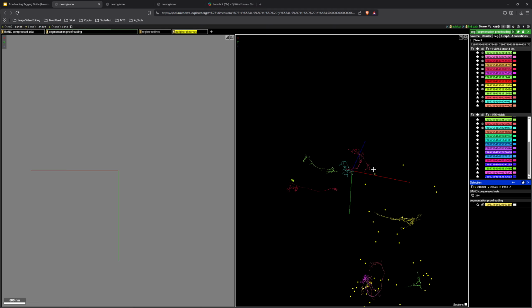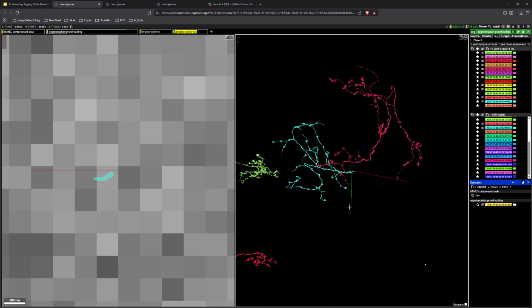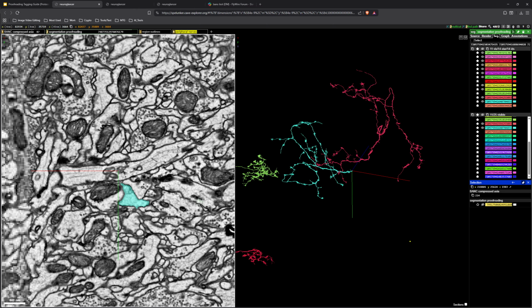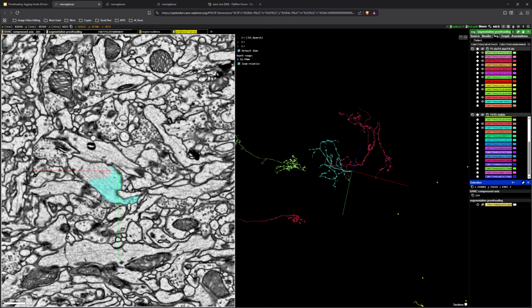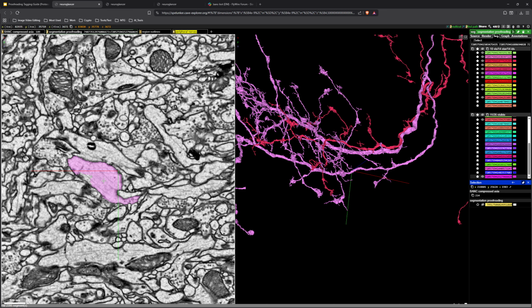And then the second level is going to be to check in the 2D if there is a true rip, large tear, that type of thing, or if it's more of a can't fix situation. So in this situation, let's take a look together. This cell was just outdated.